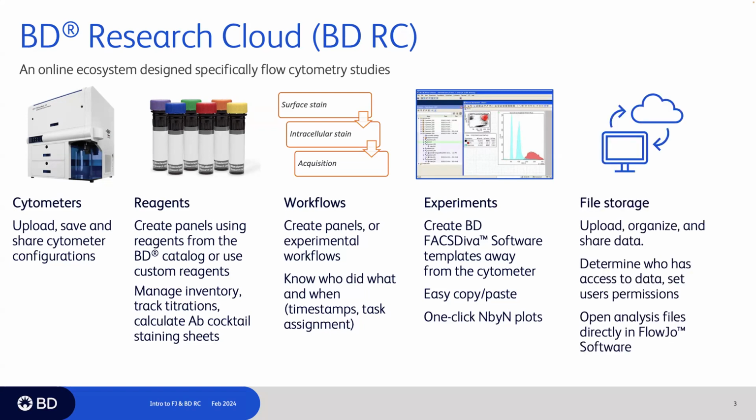And then of course there's file storage. So we can upload, organize, and share data with colleagues on BDRC. You can set permissions and determine who has access to different data, and set permissions at the user level. Those analysis files can open directly in the FlowJo software.